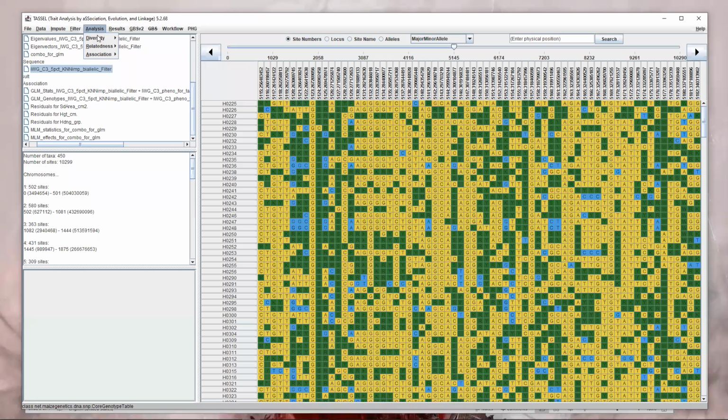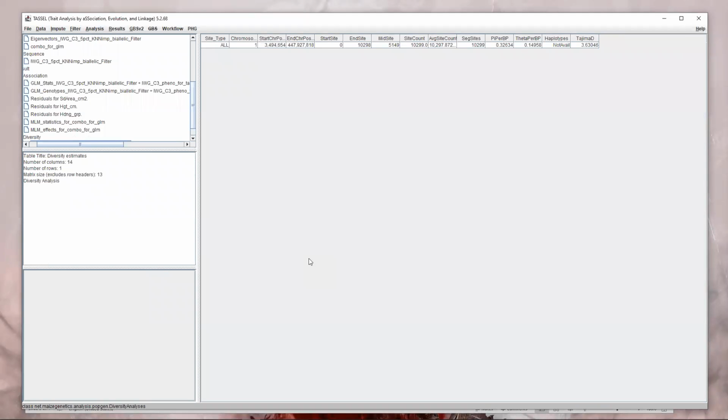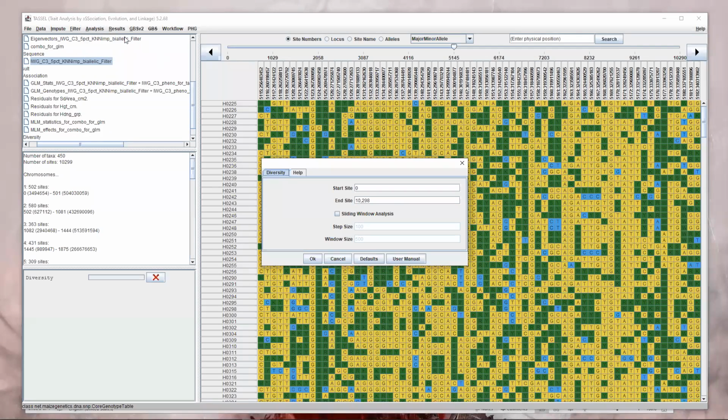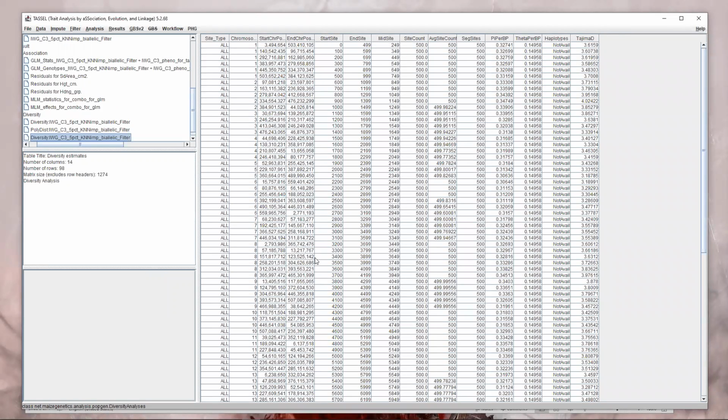Okay, yeah, and I guess that is an example to follow up. For any of the things that TASSEL offers or that we've talked about today, are there other programs that are better than TASSEL in these cases, besides data visualization?